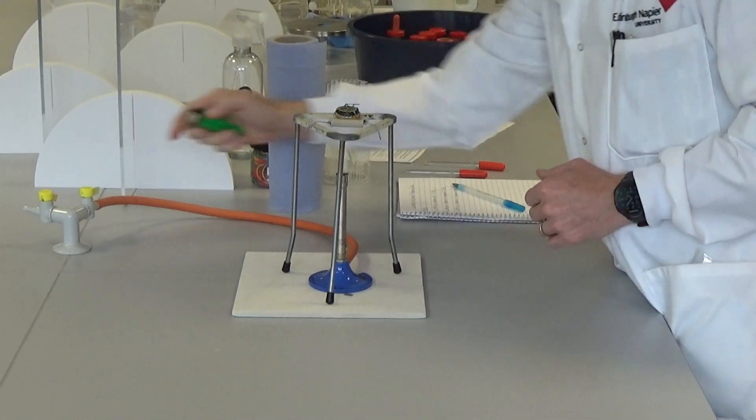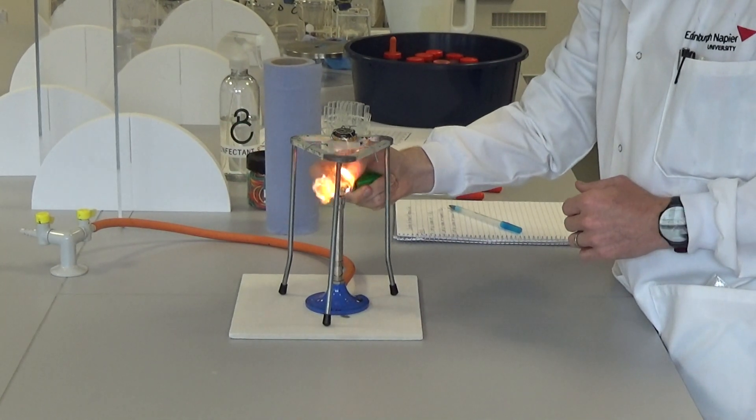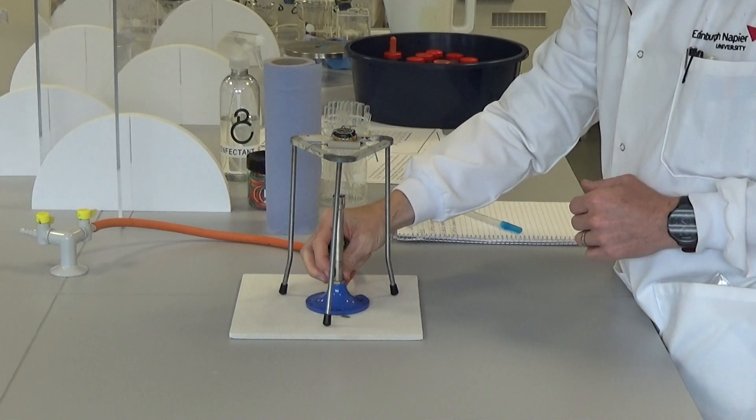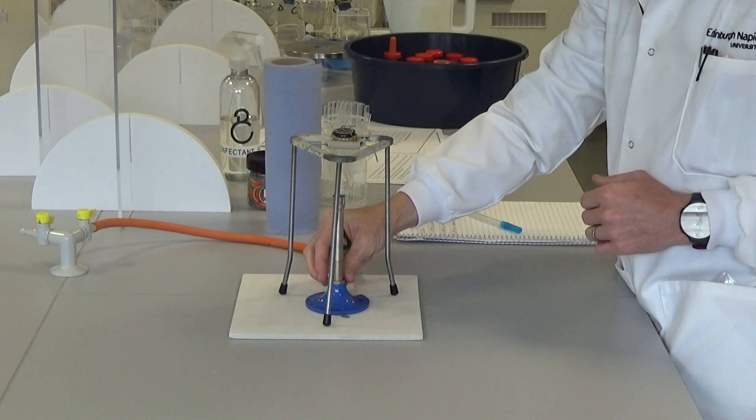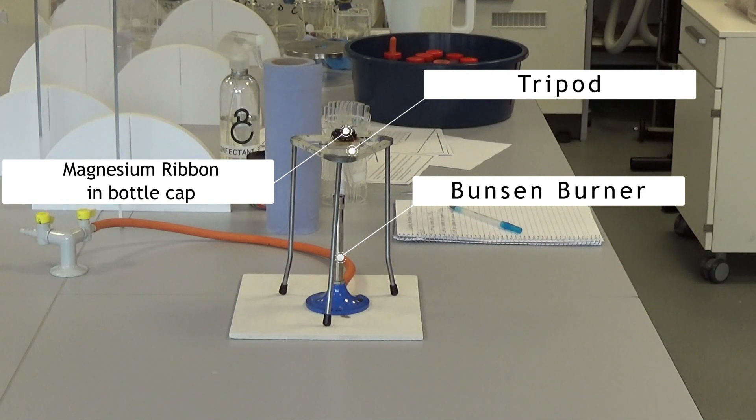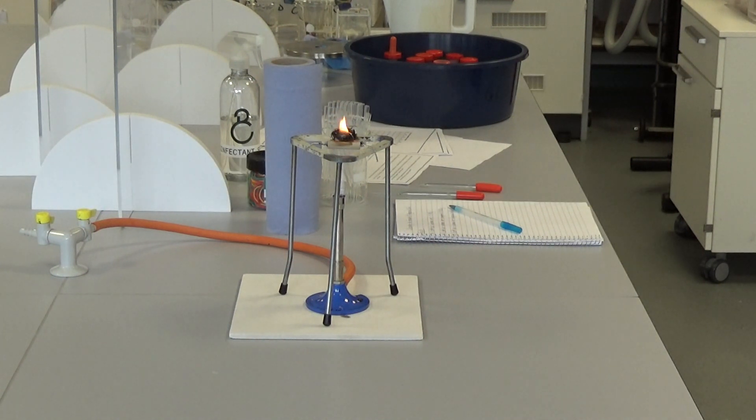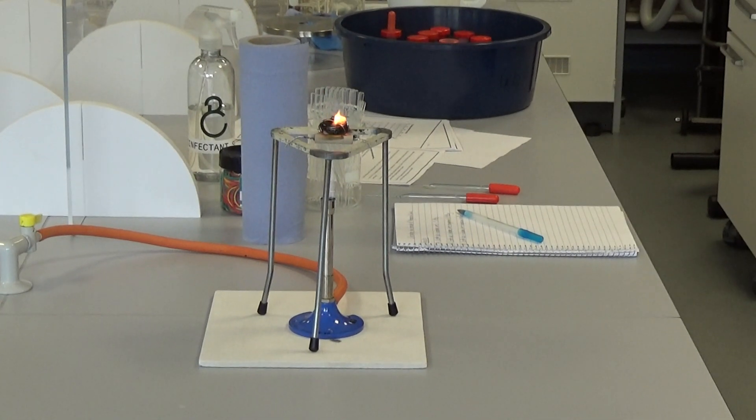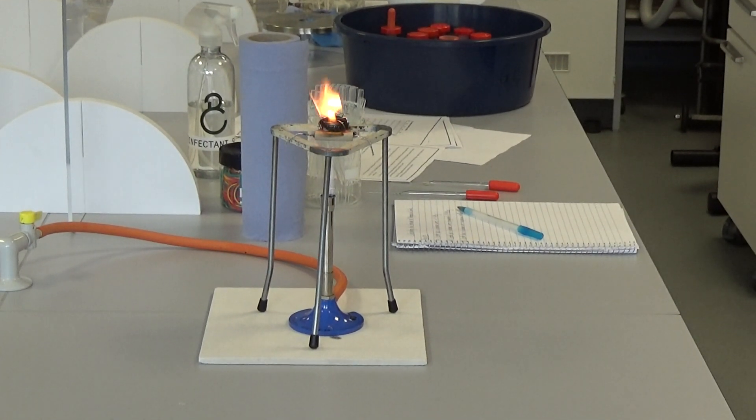So if we turn on the Bunsen, like that, and then we're putting it onto a blue flame, and we'll heat it for approximately 5 minutes. And we should see the magnesium light as it reacts with the oxygen in the air. We'll possibly see the glow through the bottle tops. It probably will go bright at some point as the magnesium catches fire.